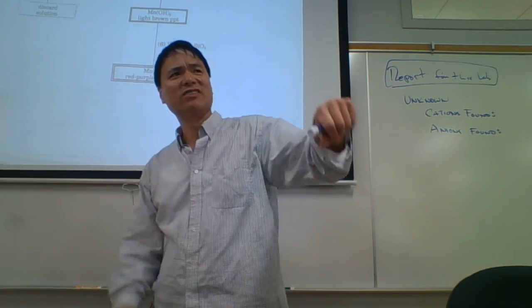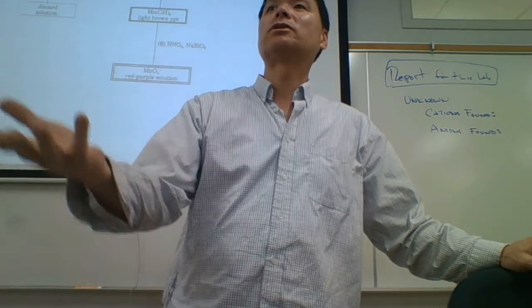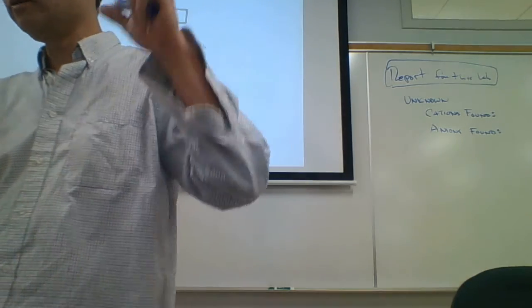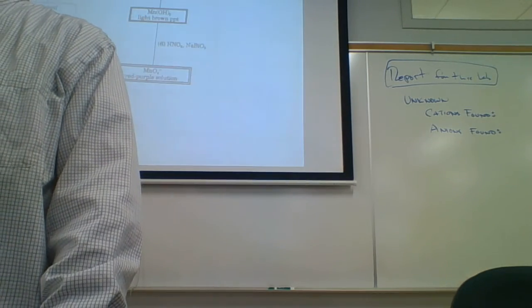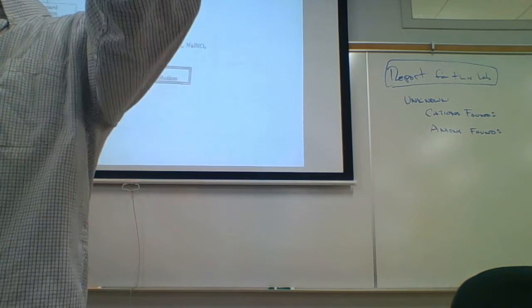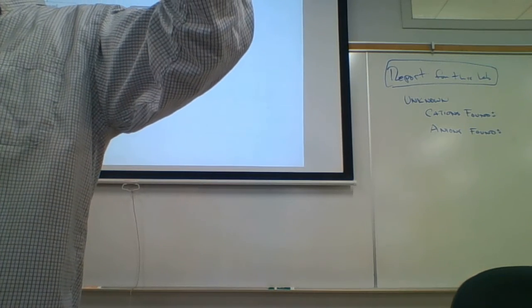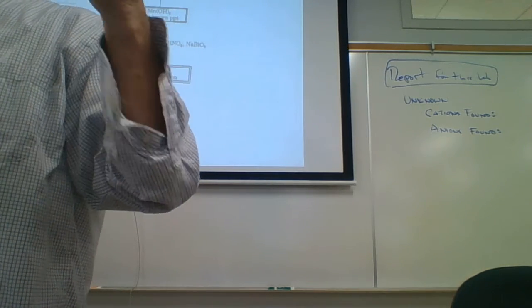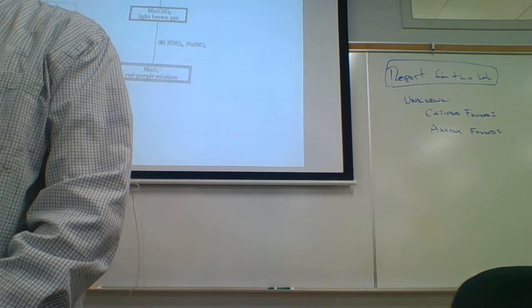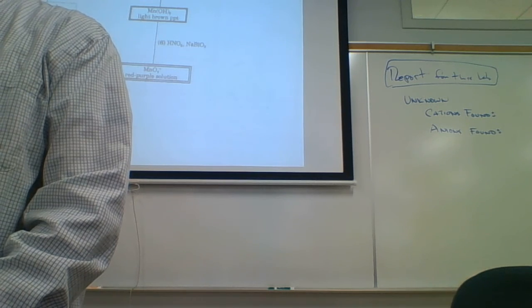It's sitting in the hood over there because in the past, I asked this question. I asked you, and nobody knows. Nobody really cares because they just want to cookbook this and get out of lab ASAP. But some people generate a huge dust cloud. It used to be outside. And one student generated a huge dust cloud of sodium bismutate. They didn't care because they didn't know what sodium bismutate is, even though I said, watch out for this stuff. It's quite dangerous. So you don't want to do that.